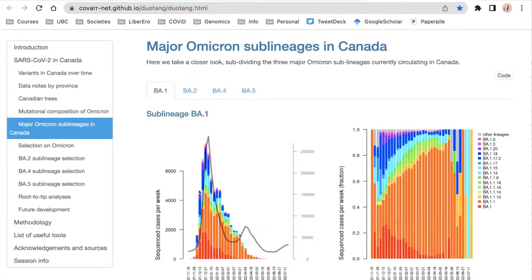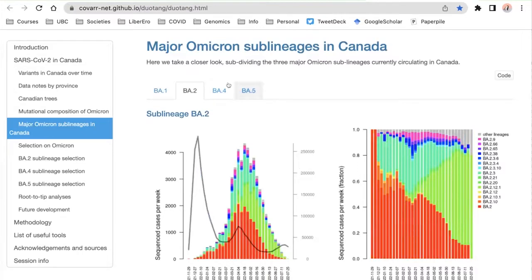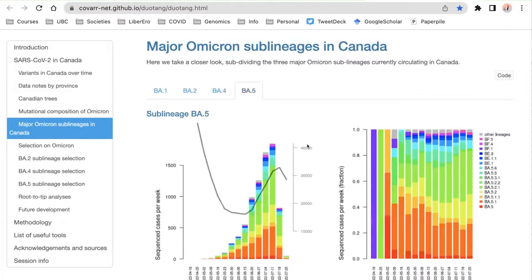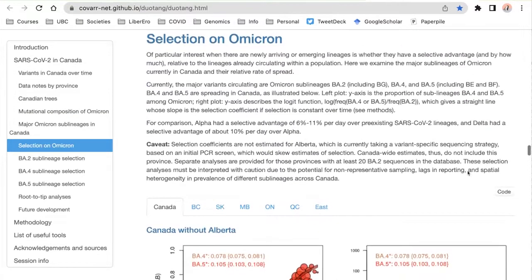Even though BA-1 is the PANGO lineage name for the larger group, you can also see the subtypes of BA-1 and how they are rising in frequency or declining in frequency over time. As time passes, each of these lineages evolves, as we can see by these multicolored graphs. Looking at the most recent one, BA-5 — in terms of overall numbers and in terms of percentage — you can see more recently that there are some groups growing in frequency. BA-5.2.1 is growing in frequency over time, and those are the kinds of things that we watch out for.